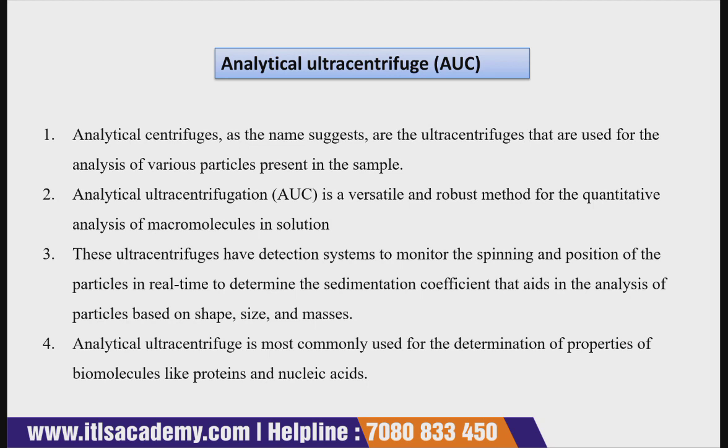That is why they are known as the macromolecules. So this analytical ultracentrifuge is a very versatile and robust method of quantitative analysis of macromolecules in solution. The third point says that these ultracentrifuges have a detection system to monitor the spinning and position of the particles in real time to determine the sedimentation coefficient, which aids in the analysis of particles based on shape, size and masses.